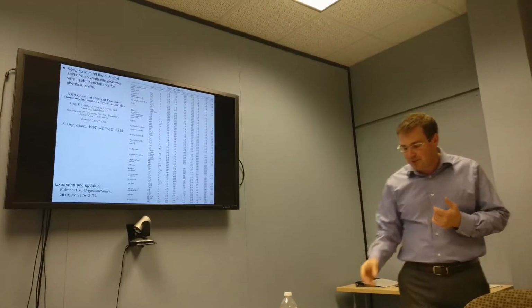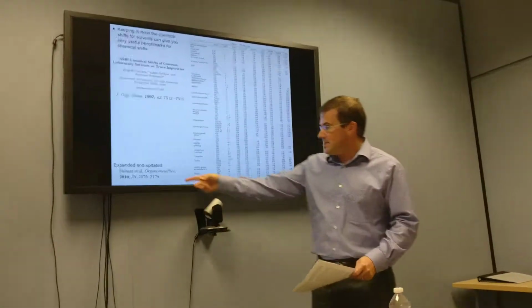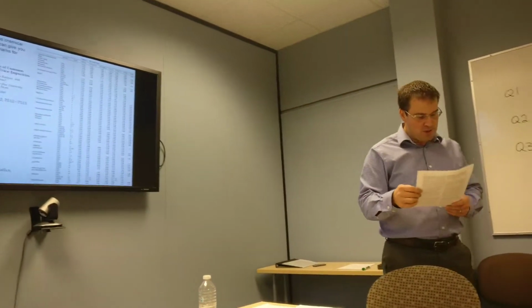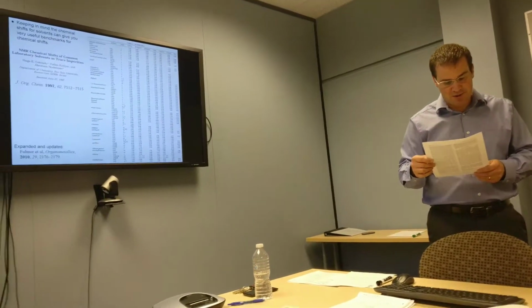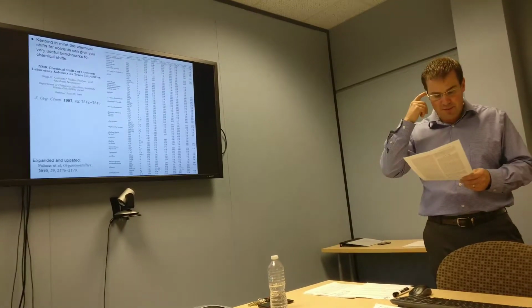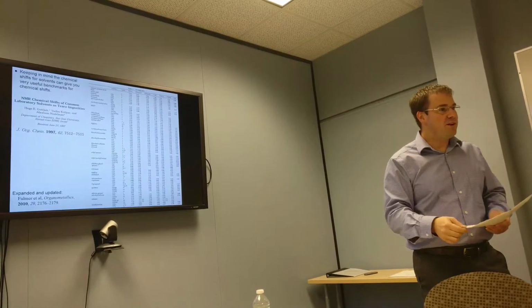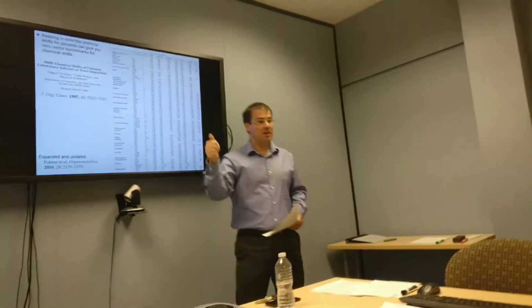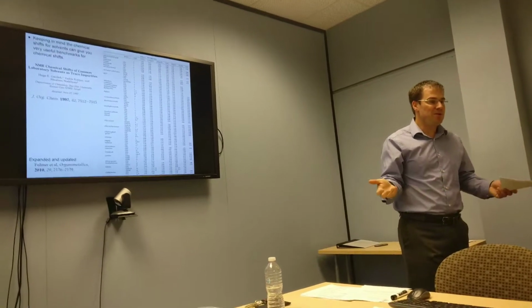But a measure of the importance of this actually comes if you read the opening paragraph on this 2010 update paper. It says, hanging above the desk of most every chemist whose work relies heavily on using NMR spectroscopy is NMR chemical shifts of common laboratory solvents as trace impurities by Gottlieb, Kotlyar, and Nudelman, which is that initial paper. And that's exactly true. If you walk around my student office area, pretty much everybody has this earlier 97 paper posted up.